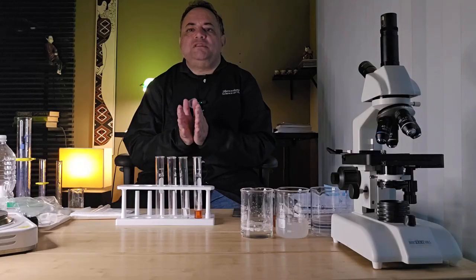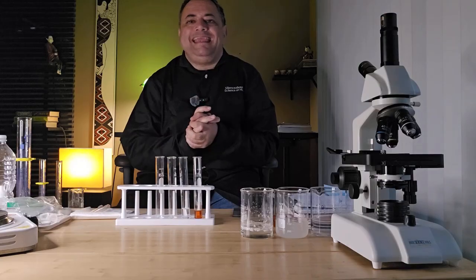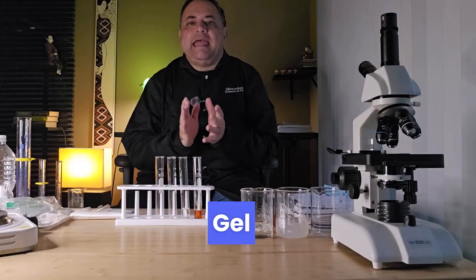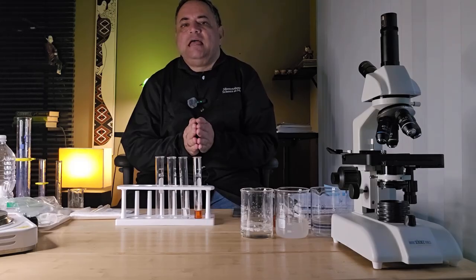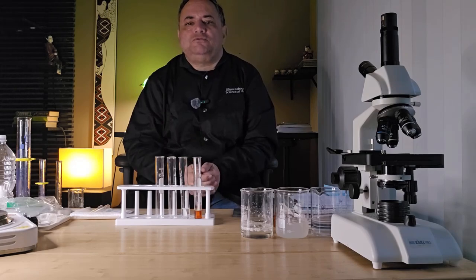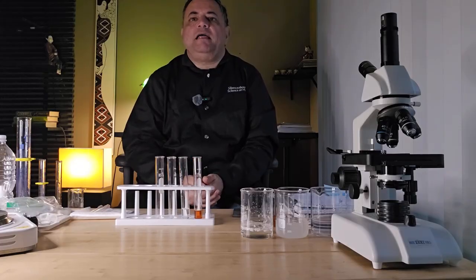Okay, let's move on to the second part, the second demonstration of a colloid, and that is forming a gel using calcium acetate. You can prepare a gel using calcium acetate and ethanol, resulting in a semi-solid jelly-like substance. And this jelly-like substance is the basis of things like emergency fuel source, like canned heat. You can buy them for camping trips or emergency supply.